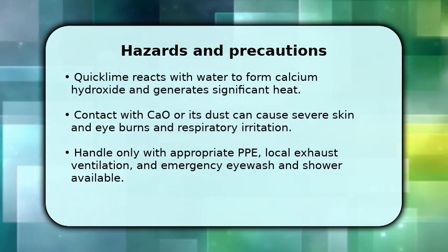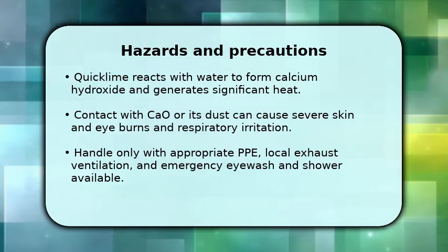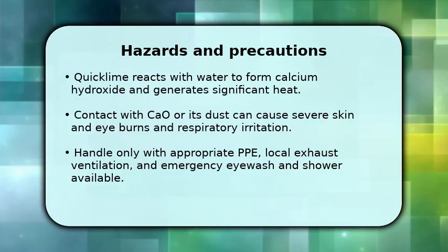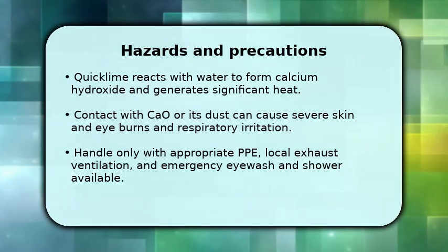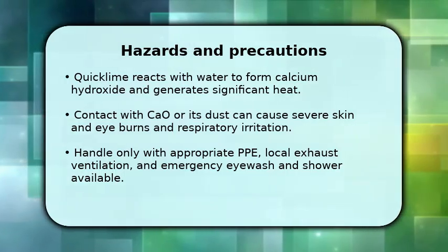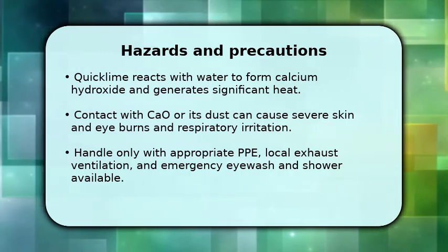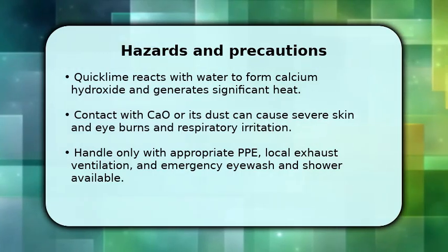Chemical-resistant gloves, goggles or face shield, long sleeves, and a NIOSH-approved respirator for particulate exposure. Ensure local exhaust ventilation, emergency eye wash and shower access, and strict controls to prevent moisture contact and uncontrolled reactions.